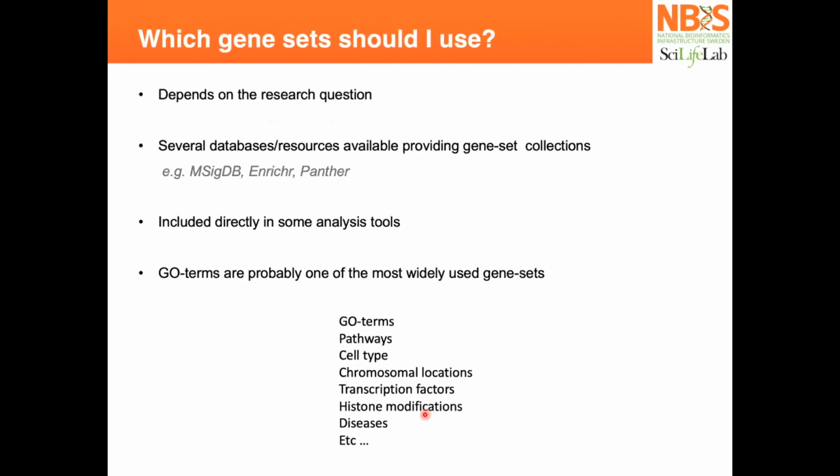May I ask something? Yes, absolutely. So for a bulk RNA-seq, you would, for example, often take a fold change cutoff for this type of analysis. Would you recommend to do that here, or would you maybe just take all differentially expressed genes? That depends on the method. So for taking the differentially expressed genes, you need to have a cutoff, both p-value and FDR, and log FC.